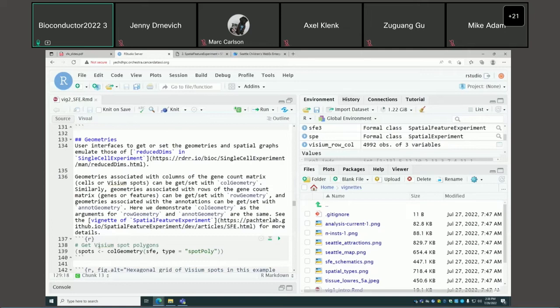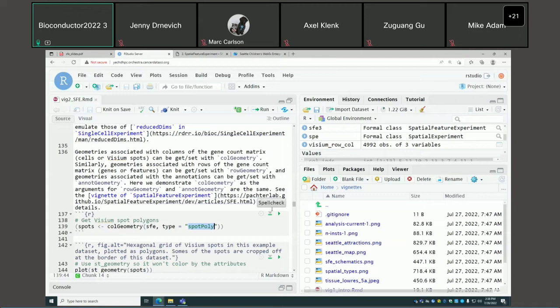For geometries, it's straightforward: for geometries associated with columns of the gene count matrix, use the colGeometry function; for geometries associated with rows, use rowGeometry; for annotations like tissue boundaries, use annotGeometry. You specify the SFE object and the name of the geometry — this is deliberately made similar to reducedDims in SCE.